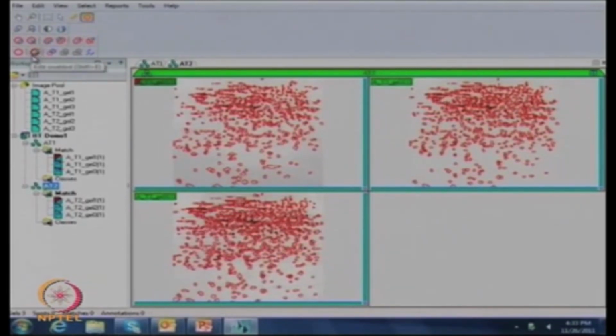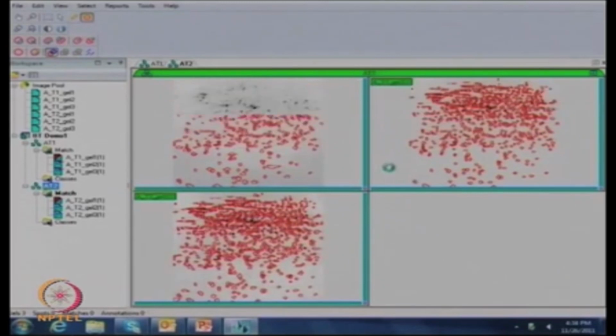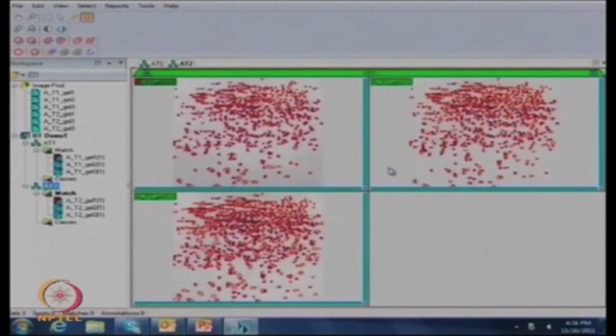Now in the same way you can go through each individual gel by zooming and 3D view, and select which are spots and which are not spots. Then you can directly match them. Now I'm doing the same matching. 1274 matches have been done. So these gels are more reproducible as compared to our control. See, there are no vectors even without giving landmarks. So this is a very fine gel. The replications we did are confirmed. These replications are okay.